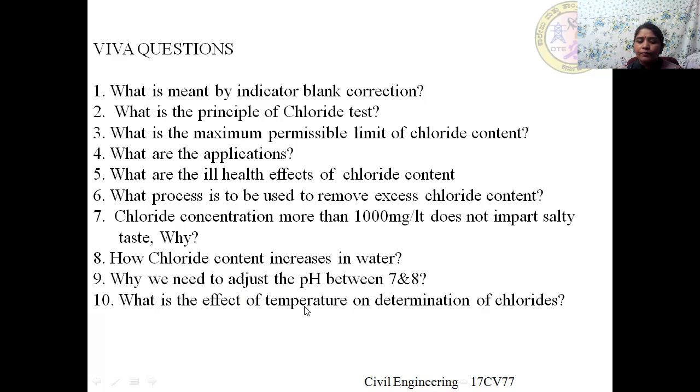This temperature is very important because we need to carry out this titration at room temperature. If the temperature is high, the increased temperature leads to utilization of more titrant, that is silver nitrate. Hence, we need to maintain room temperature.